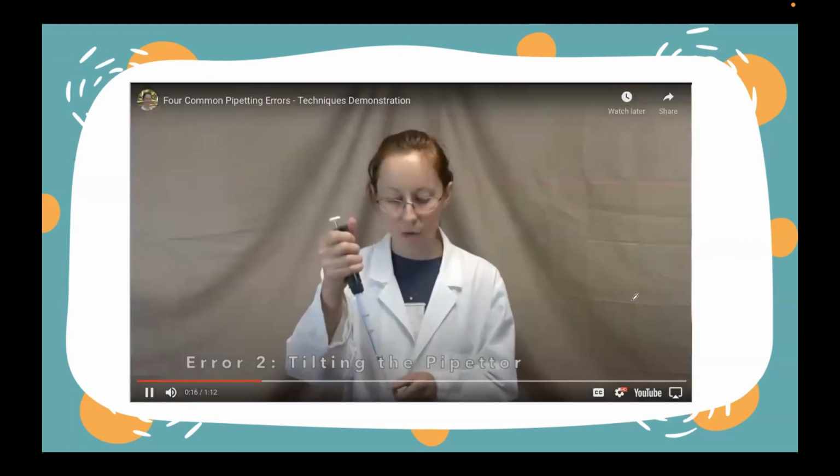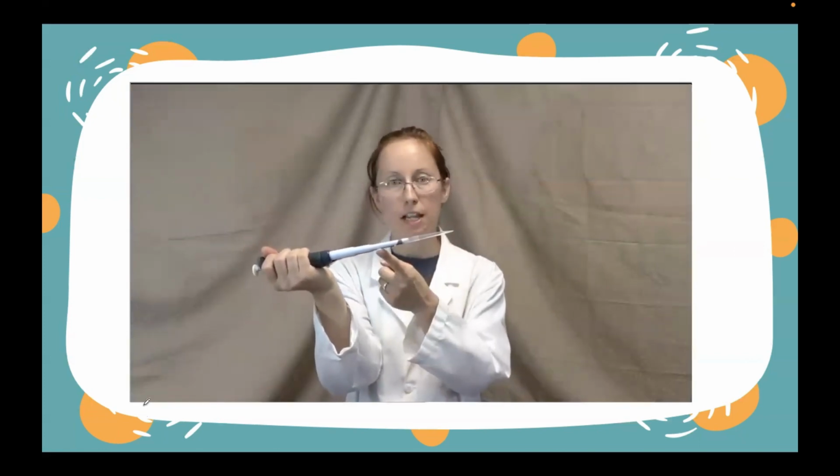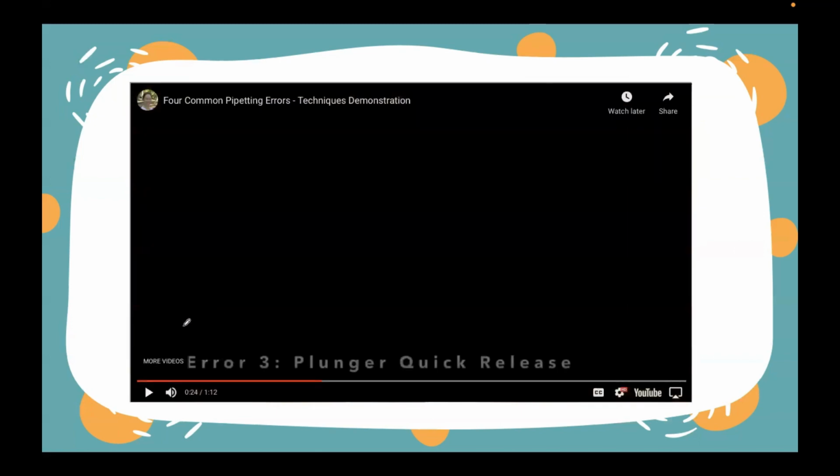Okay, number 2, always keep the pipette tip pointed down when tilting the pipettor. If you tilt it up, liquid could run into the pipette, damaging it or causing contamination. Okay, so once po na nag-aspirate ka na or nahawakan mo na si pipette at nakapag-pipette ka na sa iyong microcentrifuge tube, bawal na bawal mo po siyang i-tilt. Okay, dapat naka 90 degree angle lang and then dapat sure ka na. Once na nakapag-pipette ka na, ilipat mo na sa kabilang tube mo. Bawal na yung unsure ka pa or gumalaw yung kamay mo na nag-bend siya kasi ang tendency, yung liquid coming from the pipette tip, it will travel to your micropipettes, magkakaroon ng contamination.